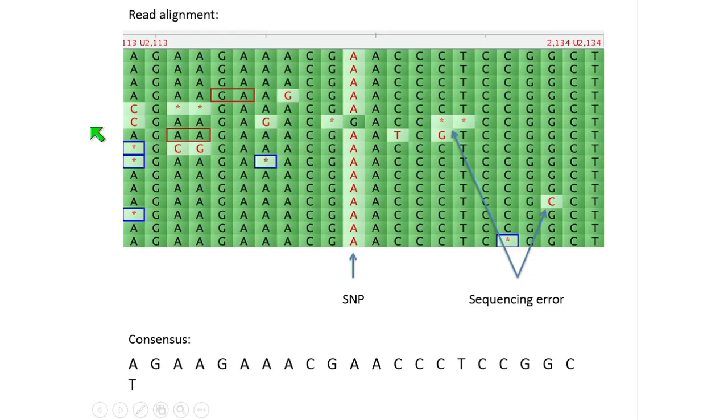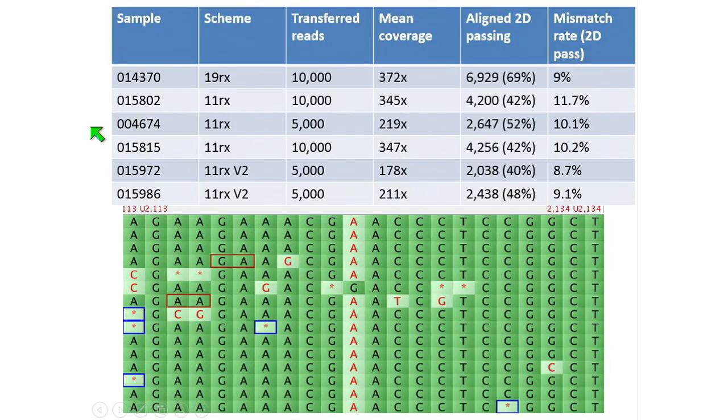So this is what nanopore data looked like at the time. I think people were put off by the error rate in terms of its usability. But you can see quite clearly that you've got mostly reference bases there in dark green. You have mutations as well. Most of that is noise, but the column of A's in the middle is a variant. So it is reasonably easy to distinguish variants from noise in the system if you're just trying to pull out a consensus genotype, which is what we want to do.